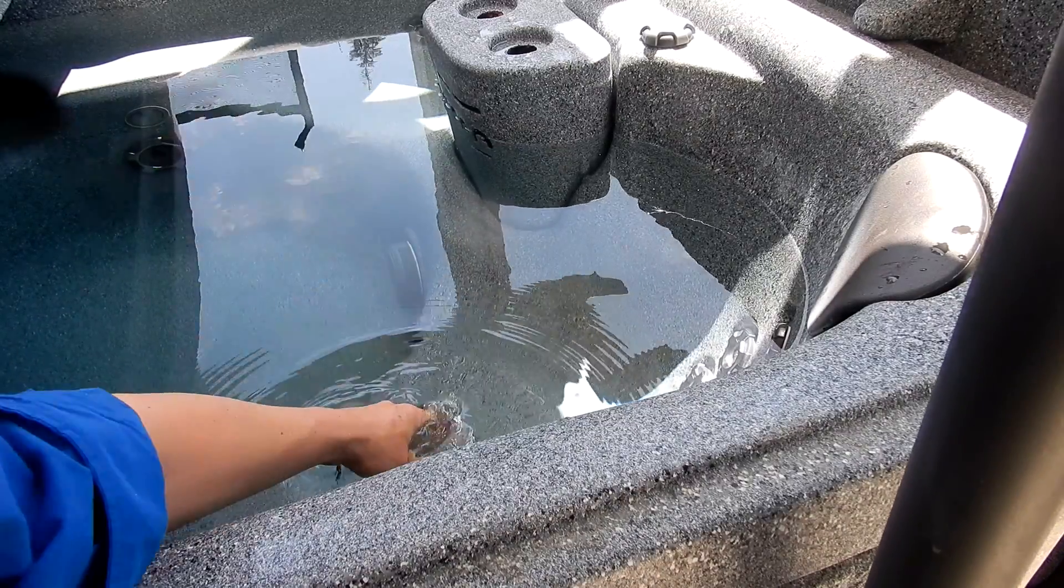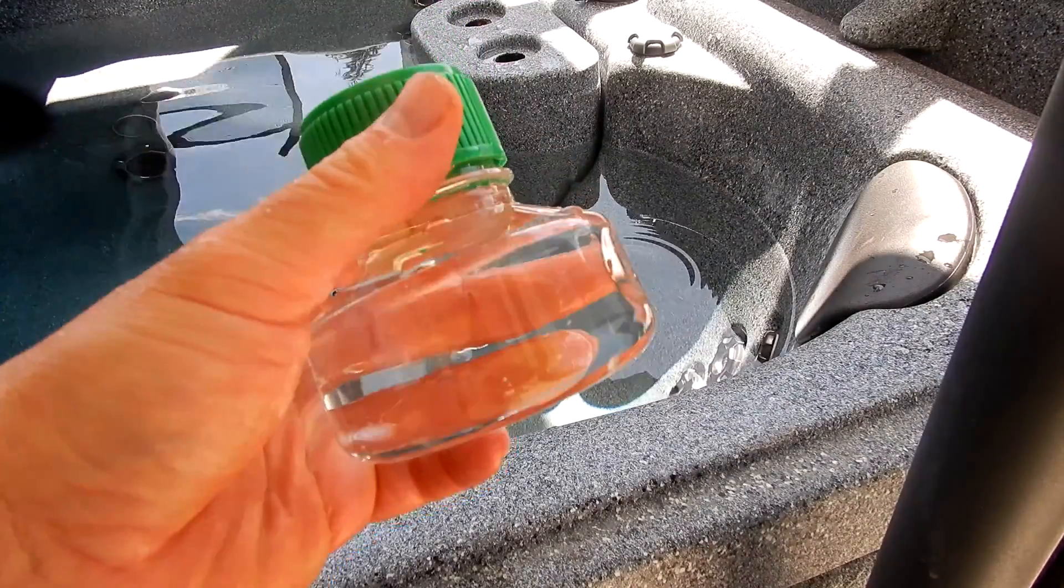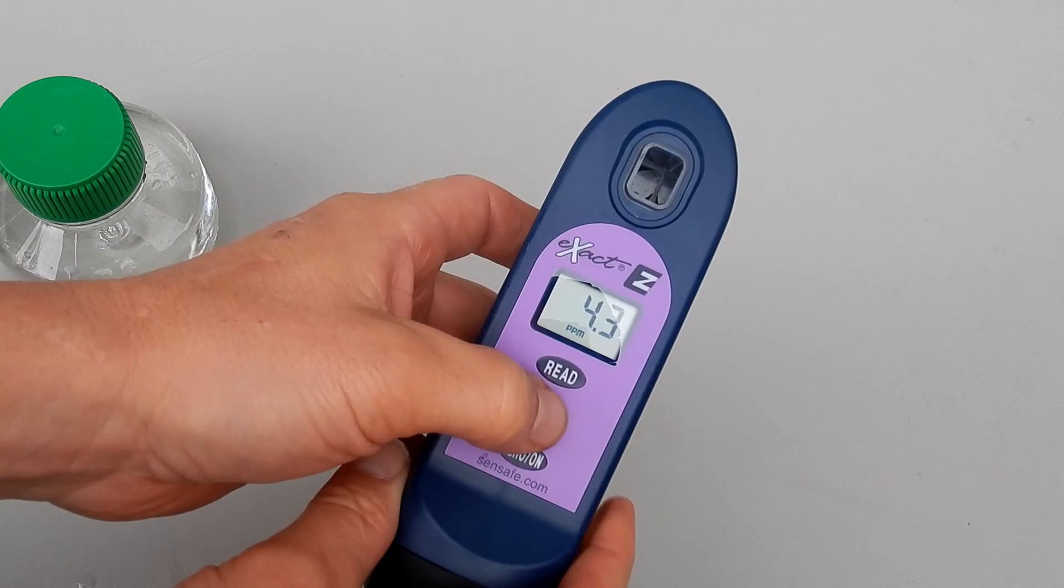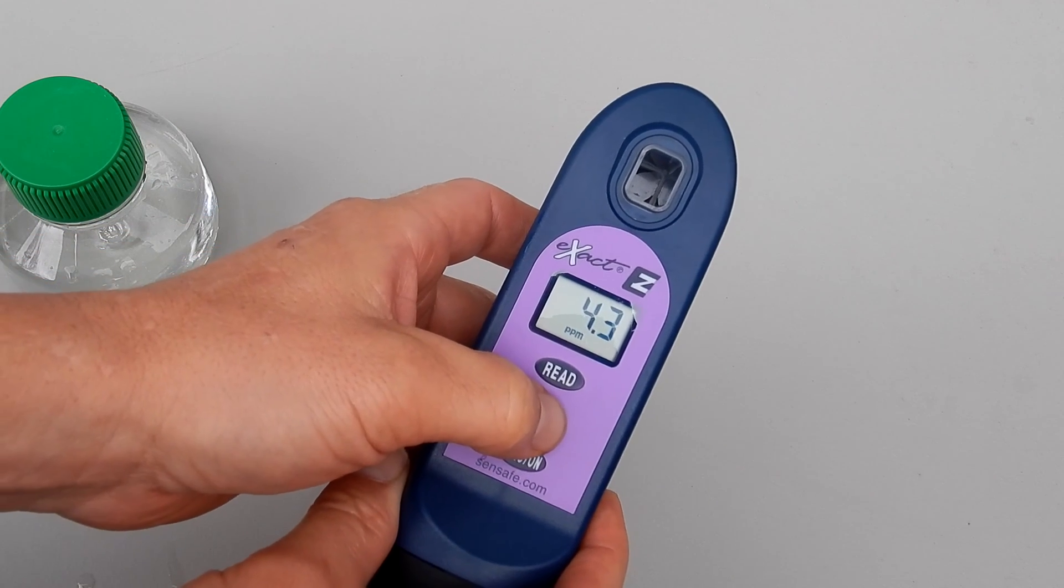Simply get a water sample from your spa to do the testing with. This is a very easy to use photometer. Simply turn on the unit here. Then you would just scroll through the menu for the different test factors.